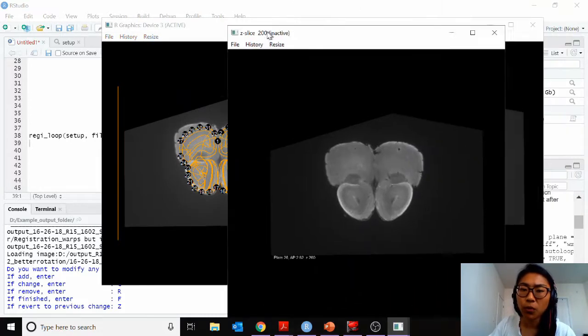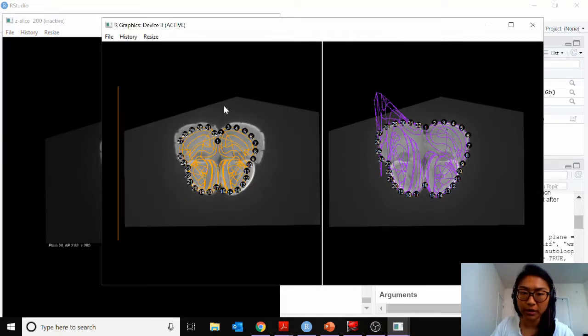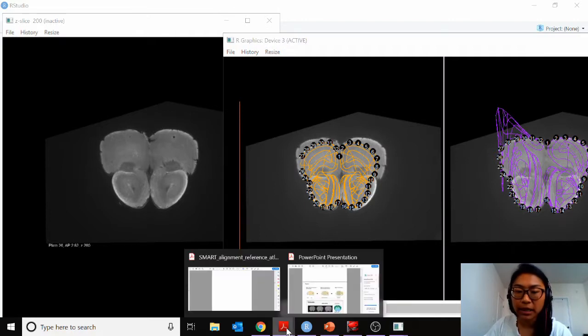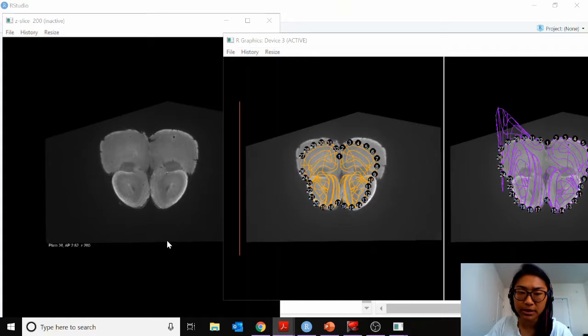And also, one other window has popped up, and this is just the raw image file underneath all of this. So this is just here to give you a better sense of the features in your autofluorescence channel without any of the atlas lines superimposed on. That can be helpful sometimes when you want to compare to, let's say, the PDF atlas right here. Where is that? When you want to align to the PDF atlas. For some reason, that's not showing up.